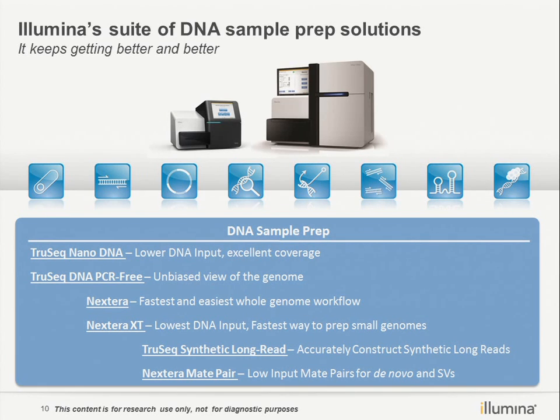And the third option, we use these 2 kits to provide some long sequence reads. For example, if your application is some de novo sequencing or some haplotype phasing study, this long sequence read will be very helpful for you to accurately construct the genomic DNA. So we have 2 different choices based on different technology. I will go through that later.